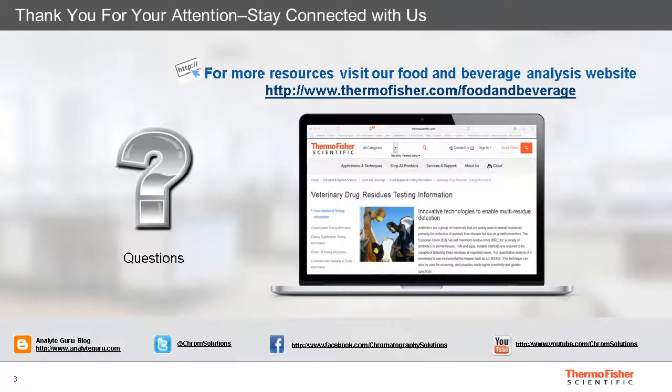Yeah, the hardware and the software that we presented today can also be used for cationic pesticides. There was another question on the same topic, which can be covered here, regarding using these systems to analyze diquat and paraquat.